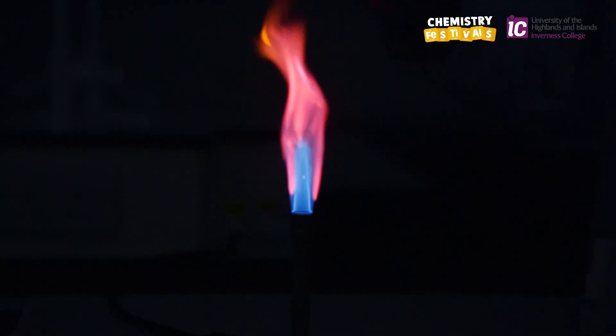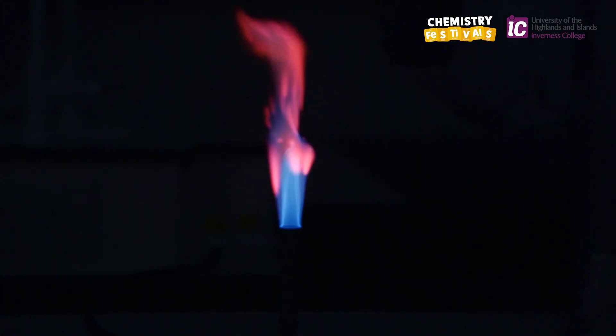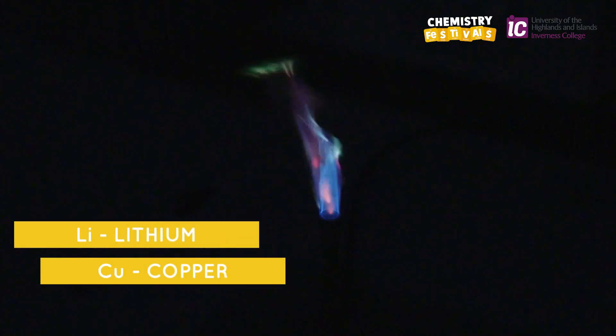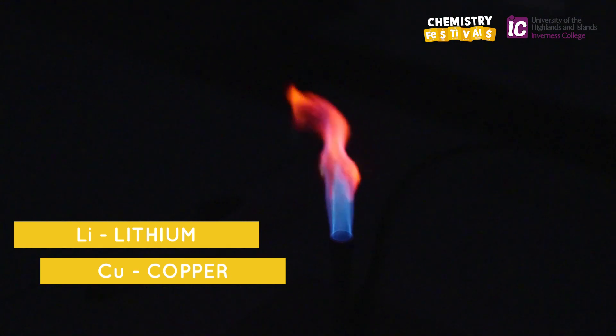I'm spraying metal A, lithium, with metal B, copper. By spraying different metals in sequence, we can make the flame change colour. We're going to start by alternating metal A, lithium, with metal B, copper. So the flame changes from crimson to blue-green, and back again.